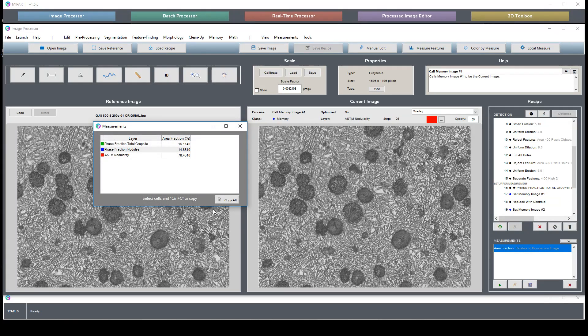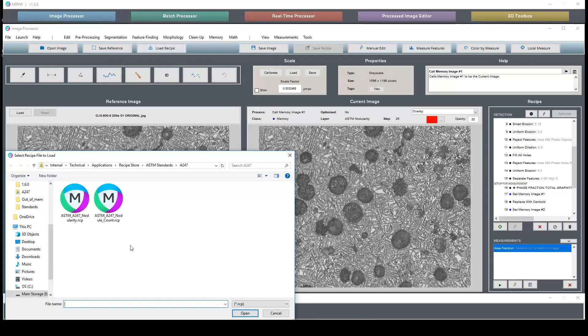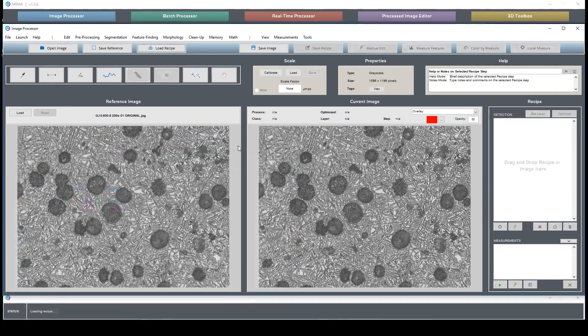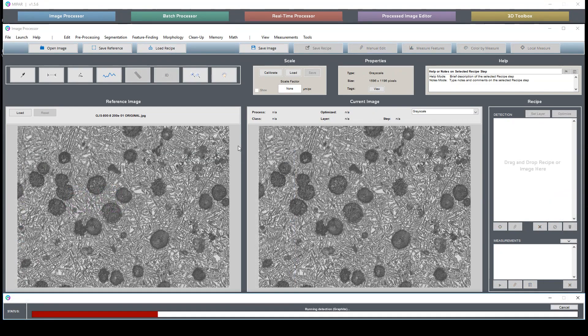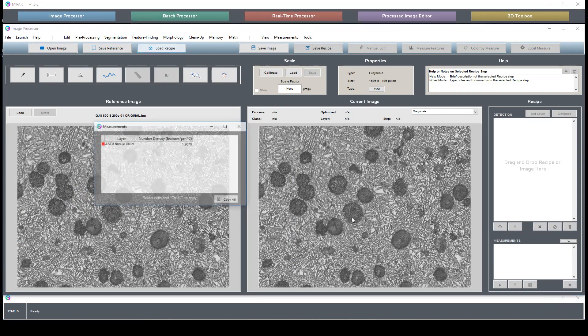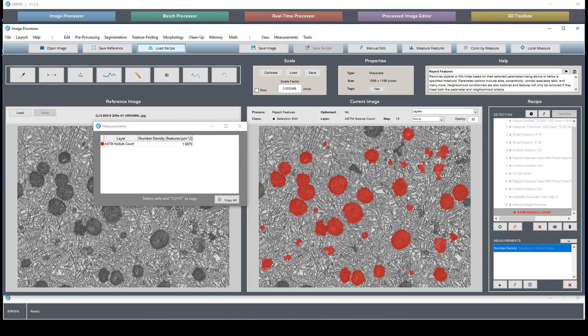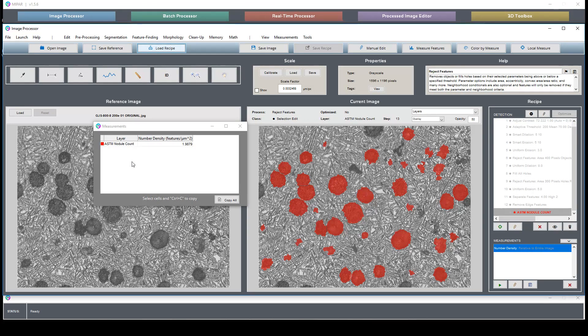But that's pretty much it for this recipe. I'm now going to load in my nodule count recipe which the algorithm that's used to select the nodules themselves is exactly the same as the previous one, it just generates a different measurement.